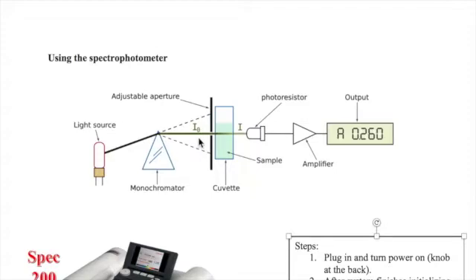The light with the chosen wavelength then passes through the sample which is placed inside a cuvette. The light comes out and is converted into a digital output reading of the absorbance value.